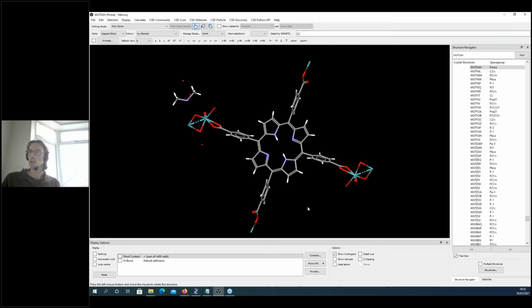But what I'd like to point out particularly is these bonds at the end here with the alternating long and short sections, and that's the quick, easy visual indication that this is a polymeric structure, and this is just a small fragment of a larger extended framework. And where you see these bonds, it indicates that there are polymer expansion options that I will show you shortly.